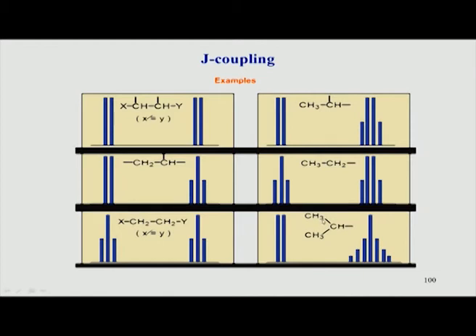So, here you can see there are 3 hydrogens, there are 3 hydrogens. Now, both are CH3, so both are further equivalent. So, what it means is that these 6 hydrogens together act as one unit. These 6 hydrogens are one unit and these 6 together are coupled now to one hydrogen. So, these 6 hydrogens, which act as one single hydrogen because they are equivalent, will show a doublet, which is shown this side, because of one single hydrogen.